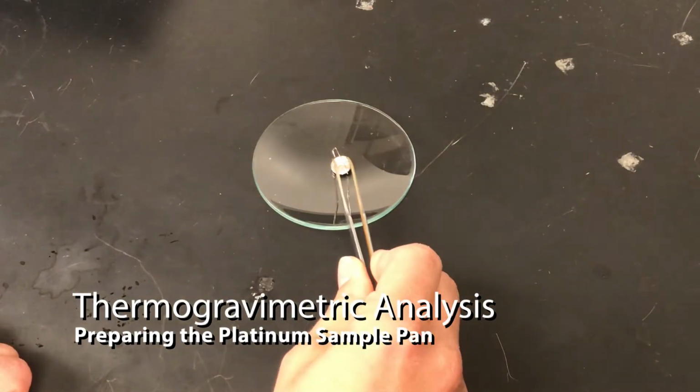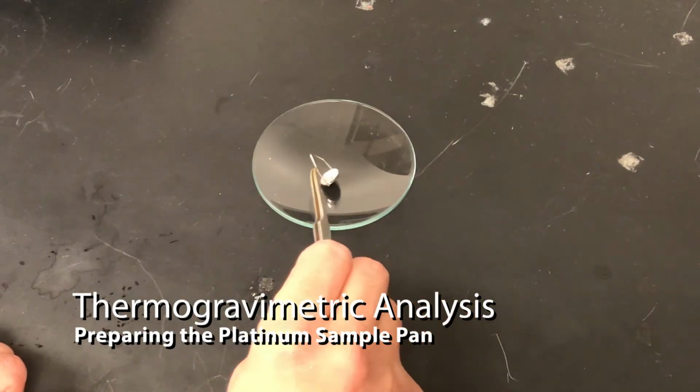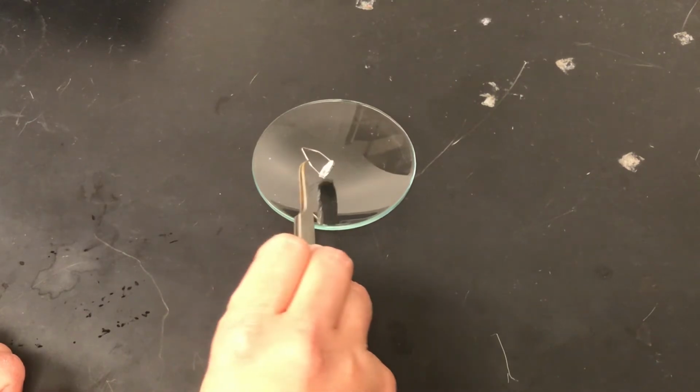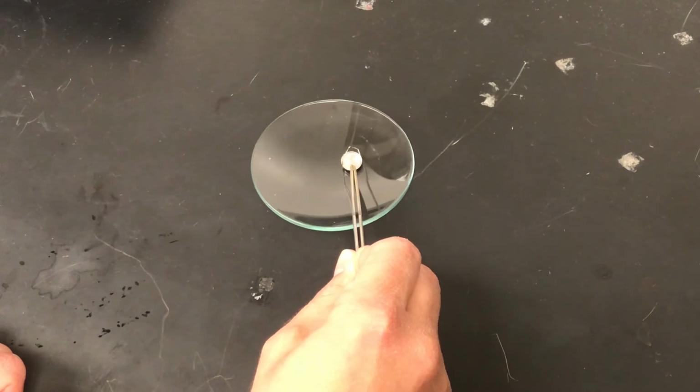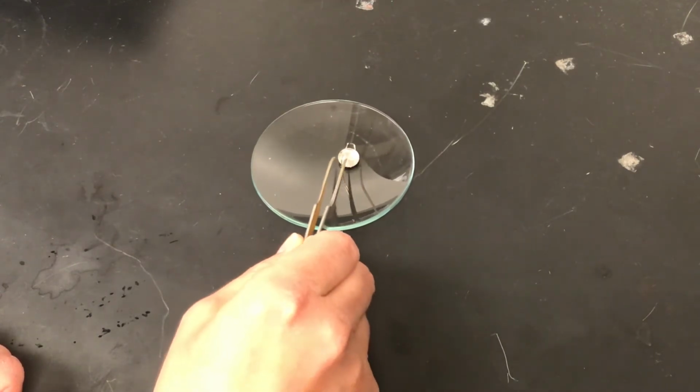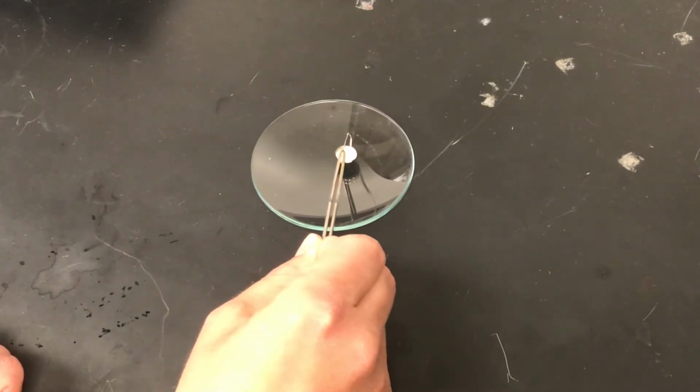So this is a platinum sample pan that we'll be using for the instrument. We'll put our sample in here, and it will get loaded onto the instrument using a mechanical arm.